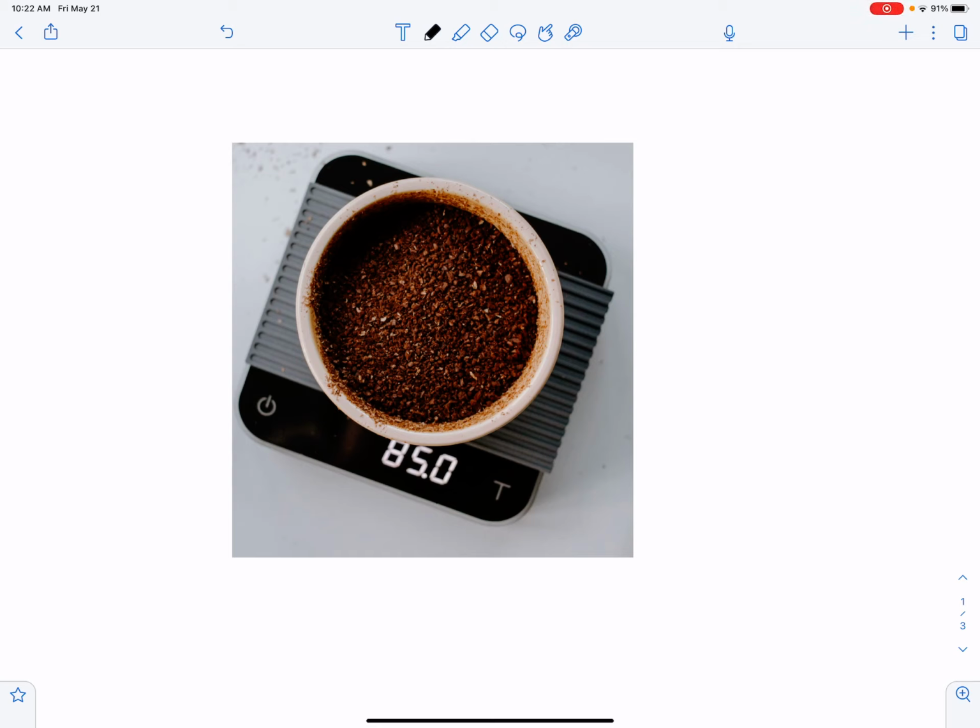When you use a scale, you should be very familiar with the idea that the last number, sometimes the last two numbers, but especially the last number, will bounce around a little bit, and you have to stay really, really still until it settles down. What the scale is really doing at that point is telling you the best guess on the last digit. That's why it's bouncing like that, because it's not sure. It's trying to find the best point, and then it's making a guess. It really is, even though it's digital.